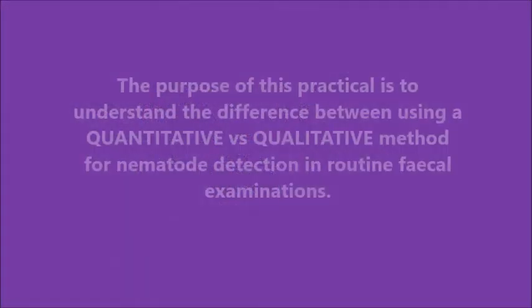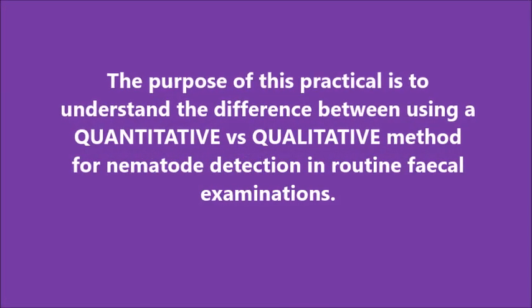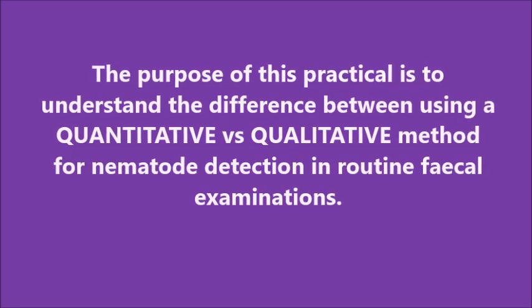The purpose of this practical is to understand the difference between why we use a quantitative method, McMaster, versus a qualitative method, simple flotation, for the detection of nematode eggs in animals.